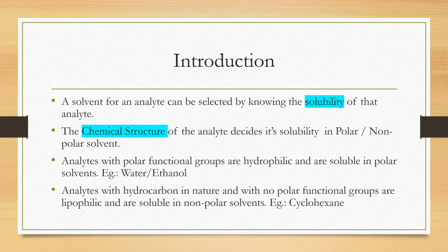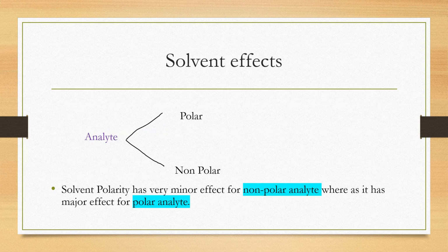Analytes which do not have polar functional groups and are hydrocarbon in nature are lipophilic and are soluble in nonpolar solvents like cyclohexane. Coming to our topic, solvent effects on UV visible absorption spectra.